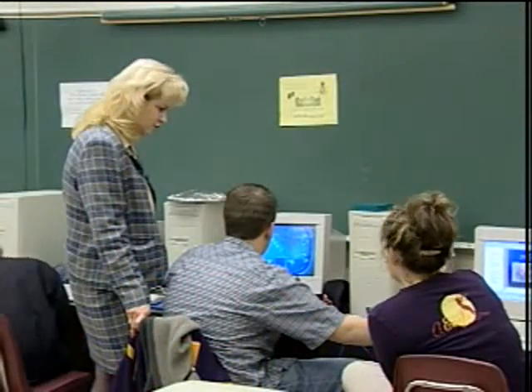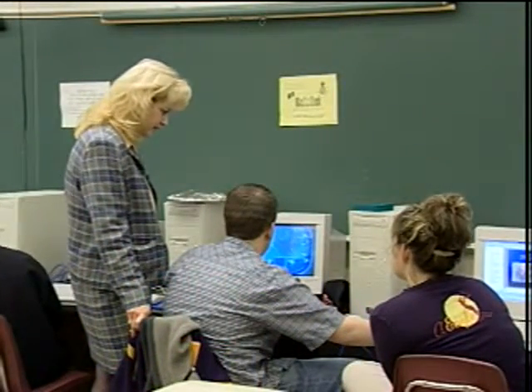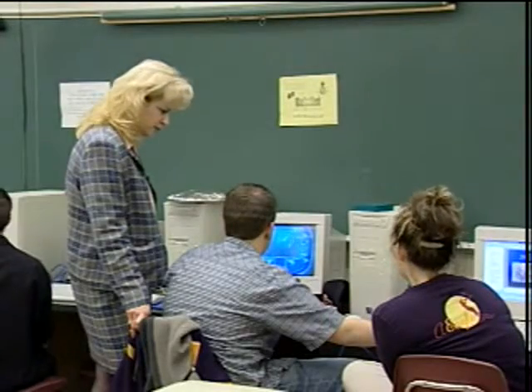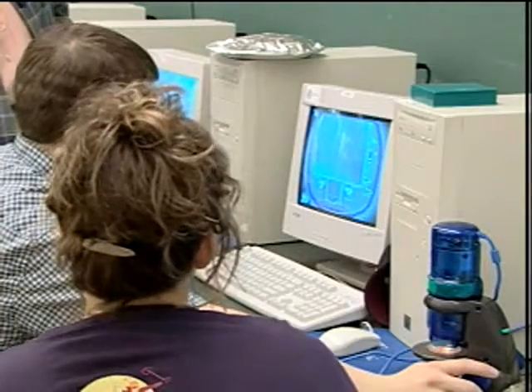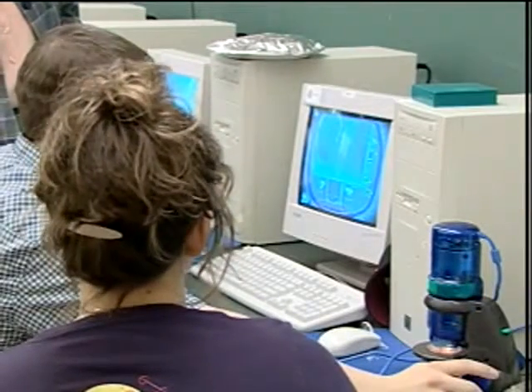You notice they have two light sources, the top light and the bottom light. Which one works best? Top light. For the worm, it's the top light. For the worm, the top light? Yeah, because the bottom one doesn't have a shadow. All right.